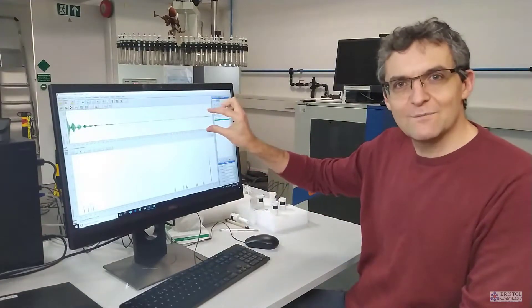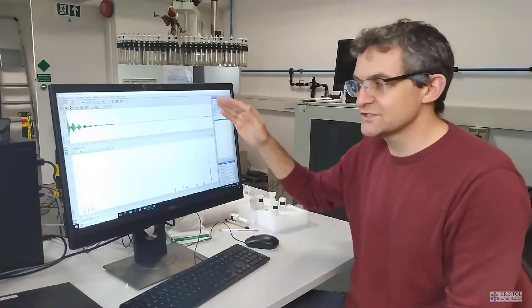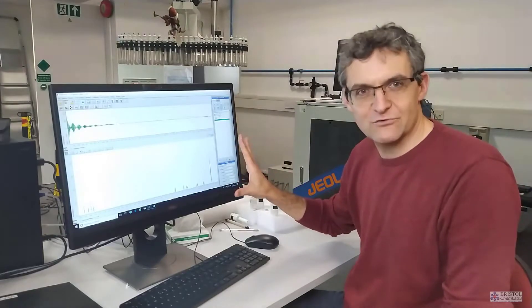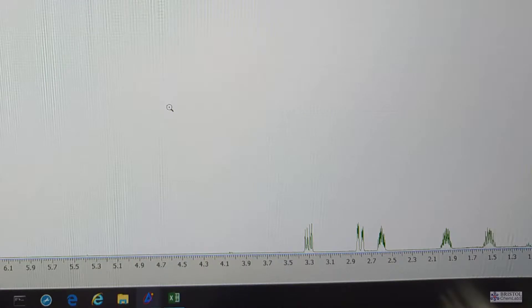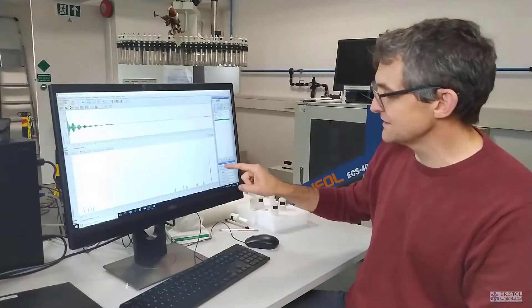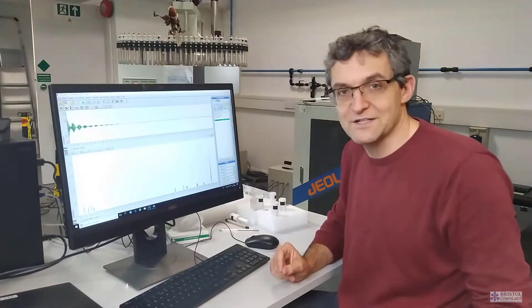Here we've got an NMR spectrum. At the top here, this is actually the NMR signal that the instrument measures. And that gets Fourier transformed, which is just a mathematical process, to turn it into the NMR spectrum that you'll learn about. In an NMR spectrum, we can see there are a series of signals. There's in fact 11 signals in this NMR spectrum. And that tells us we've got 11 different types of protons or hydrogen in this NMR sample.